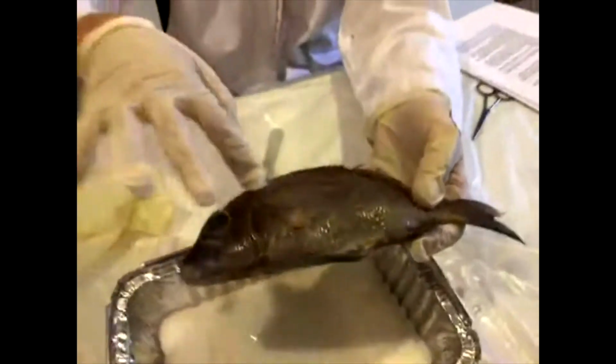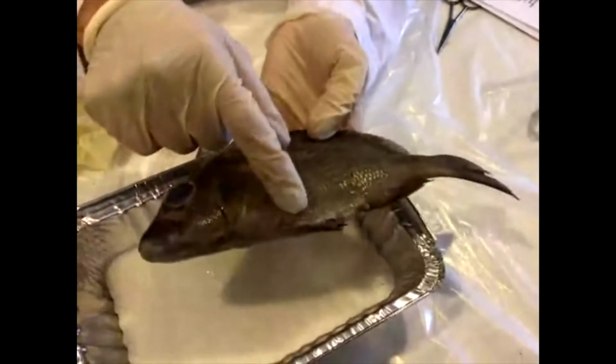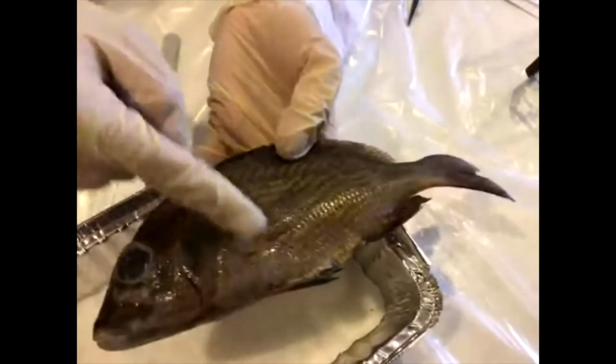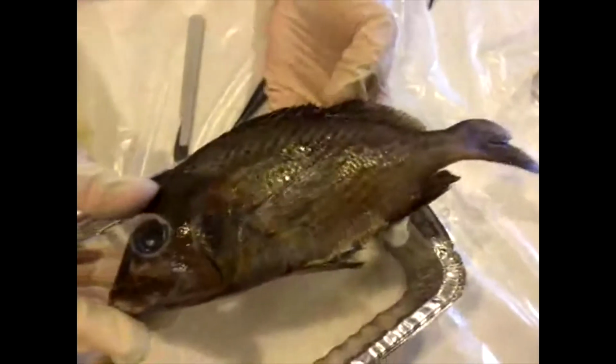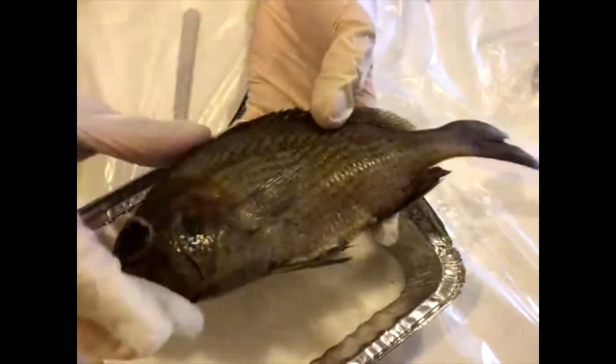So if you are going to draw along for this dissection, there's a few things. You're not going to want to draw this fin here, because we're going to kind of draw a window in, and we're not going to draw this plate here. So maybe hold off on drawing anything until we identify specific body parts, and then I'll give you hints on what to draw.